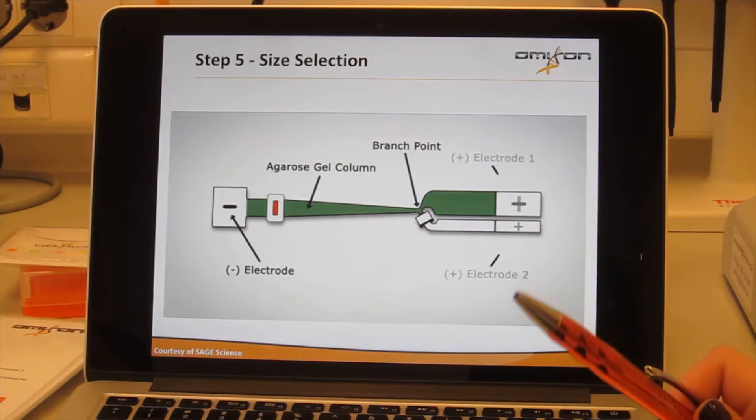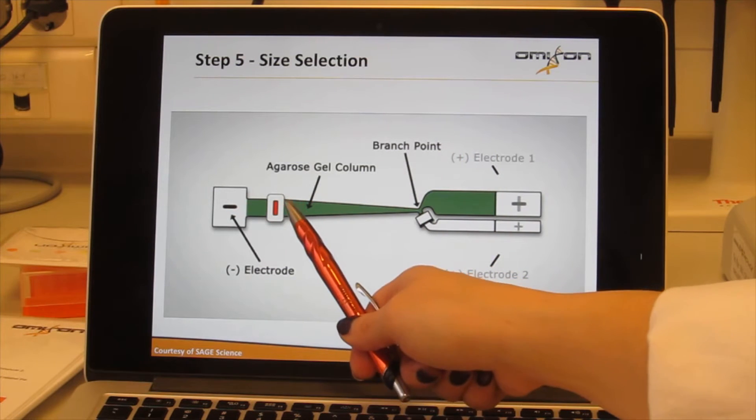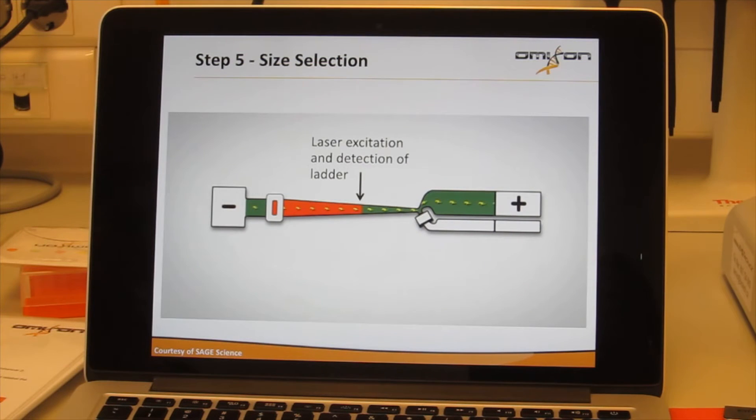The idea is that we have two fluorescently labeled markers. One marker is a 50 base pair fragment and the second marker is 150 base pairs. What we do is mix those two with our library and load the library and marker mixture in this loading port where the red is right here, and then we turn on the current.